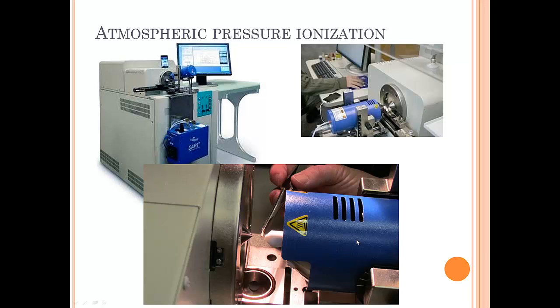DART stands for Direct Analysis in Real Time, and in this picture it is this blue component of this instrument. DART is an atmospheric pressure ionization, unlike GC or LCMS, in which samples need to be prepared either into the gas phase or in the liquid phase.